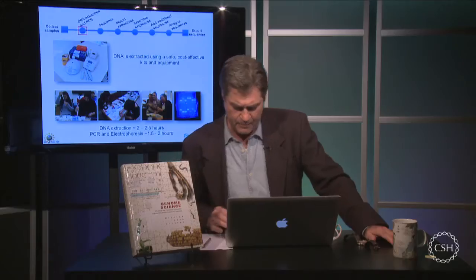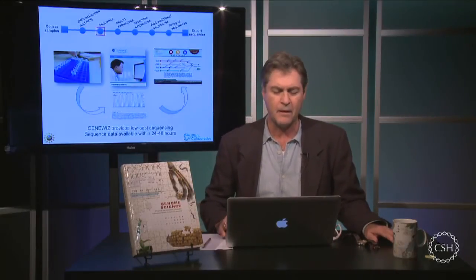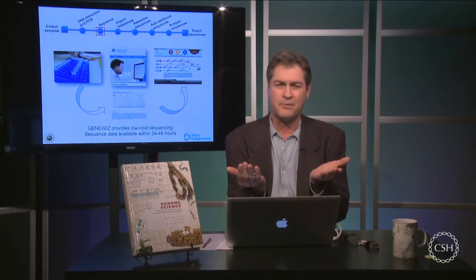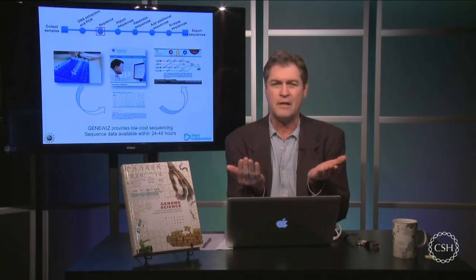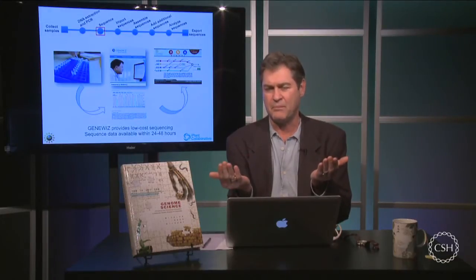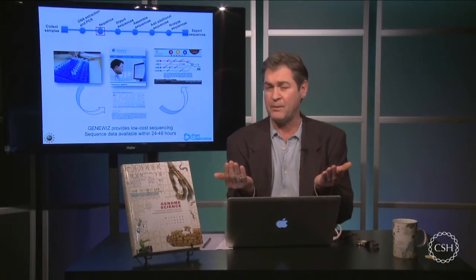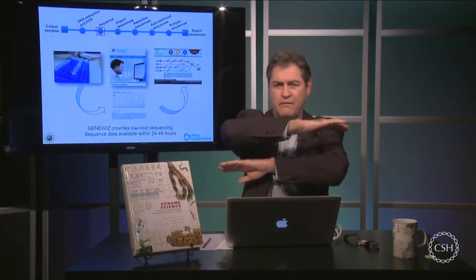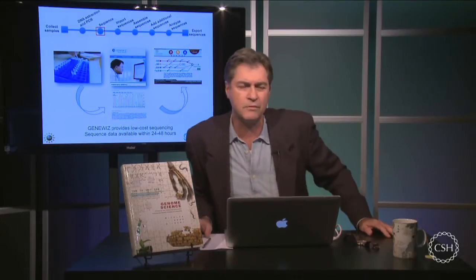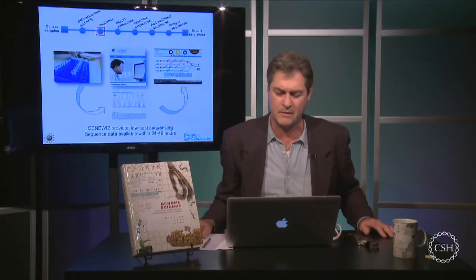Once you know that you've successfully amplified a barcode, you divide the remainder of your sample into 2 fractions, and you send these out for DNA sequencing. As we'll see in a moment, if you'd like to get data that can be published, you will do a forward and a reverse sequence. If you'd just like to do a classroom activity, a single forward sequence is enough.